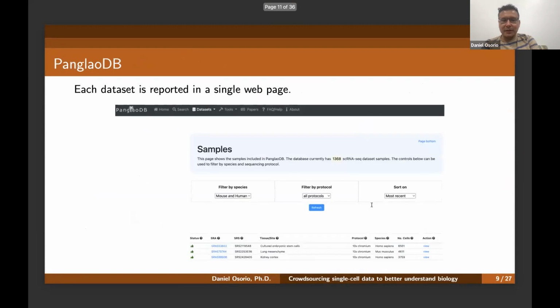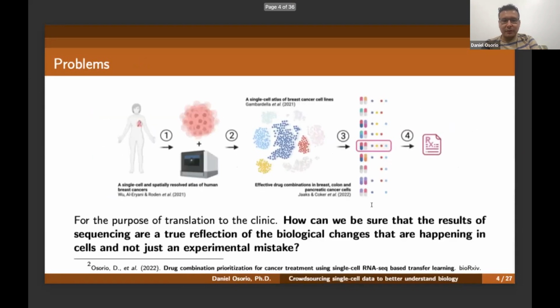Yes, it works very well. For example, in this project where we trace back the tumor cells from the patients to their most similar cell lines, the atlas of cancer cell lines was done using smart-seq approaches, and the cells from the patient tumors were sequenced using the 10x Chromium system.